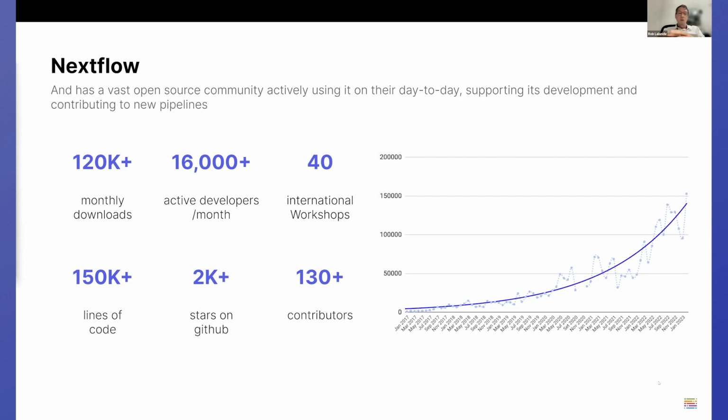And it's hugely useful that users can take these best-in-class NF Core pipelines and run them directly on Tower, perhaps forking them to use them internally, maybe even modifying them to address their own specific analytical needs. Next slide, please, Harshal.